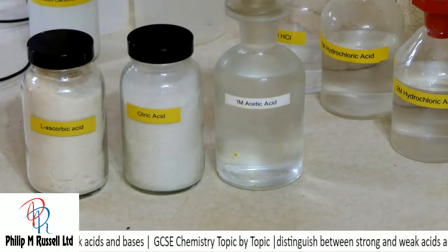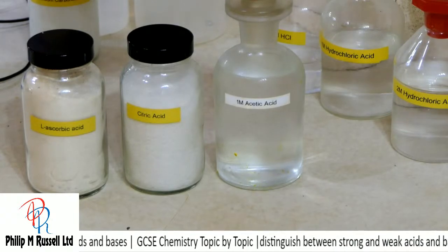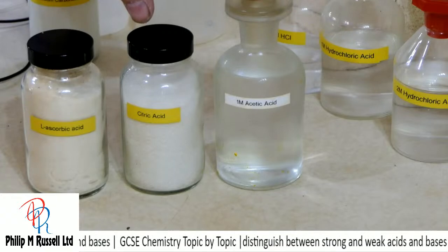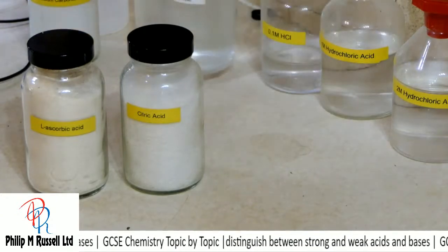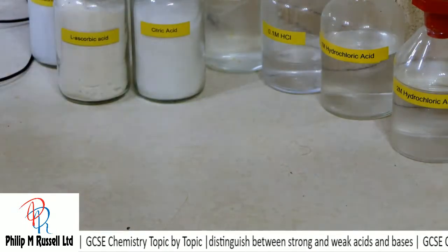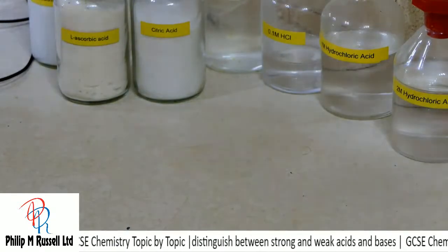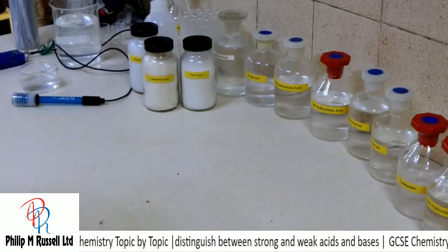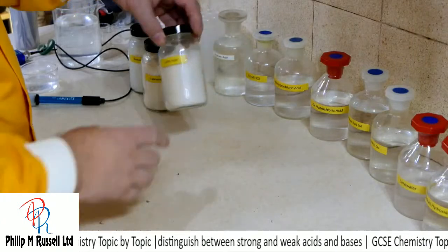This, of course, I've got in different concentrations. I've got another one of these, which I'm not going to use today, called glacial acetic acid. As strong as it can get, acetic acid. So let's start off with a very simple idea about what we've got. Let's zoom out a little bit so you can see what's going on. And first of all, we're going to do a very dangerous experiment.